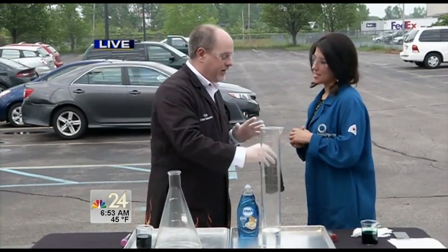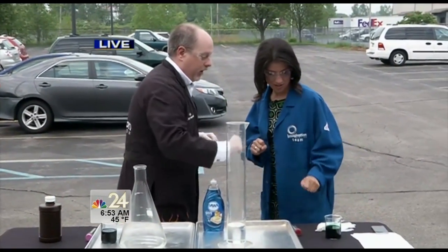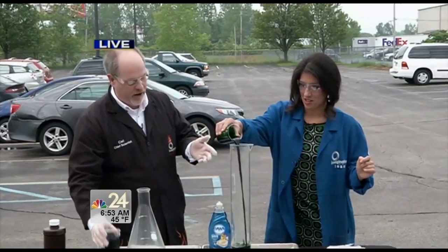You have 3% at home, so this is more than 10 times more concentrated. You definitely don't want to get it on your hands, that's why I have it down in this container. We also have some food coloring — probably a lifetime supply of green food coloring. Go ahead and dump that in. We want this to be very bright when we do it.